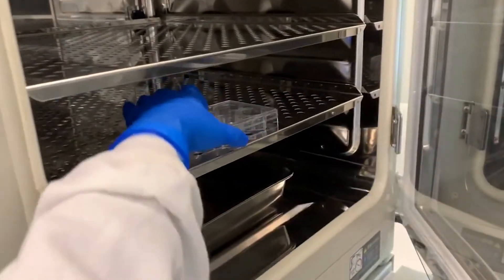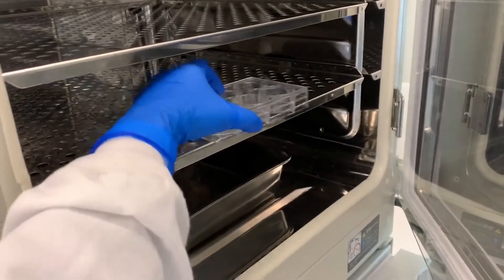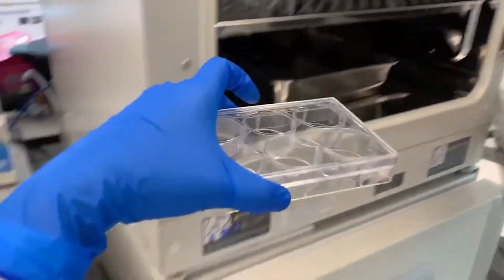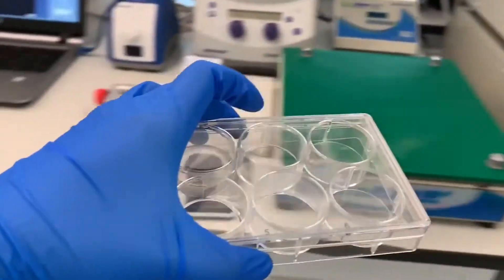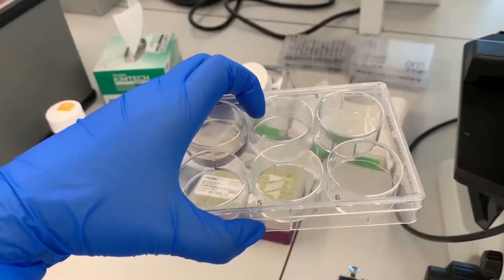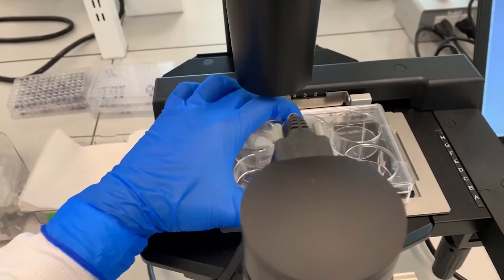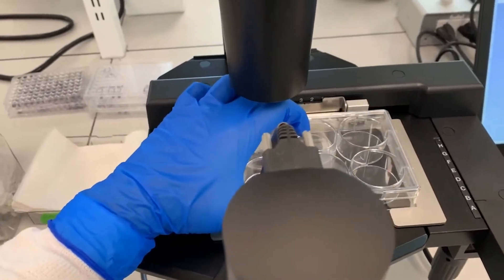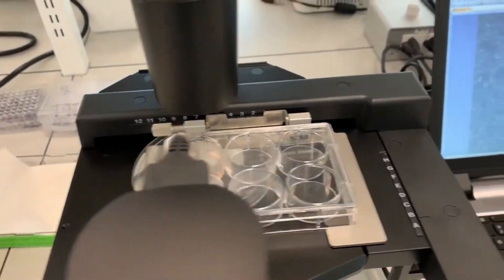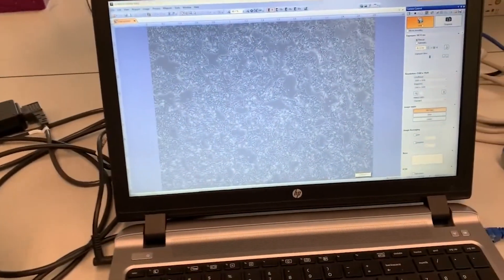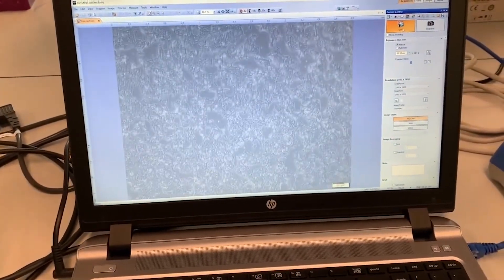Let's take them to the light microscope. Stem cells here are growing in a 2D plate until they are ready for experiments.